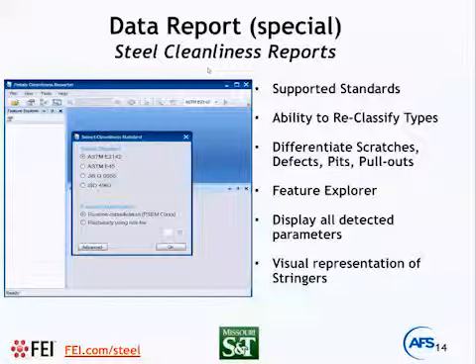Okay, so with this technology being developed over the last few years, in the steel mills it has got a lot of adoption. We have seen that in both the mini mills and integrated steel mills, the ASPEX automated SEM-EDS technology has been widely used in the various processes in steel making.